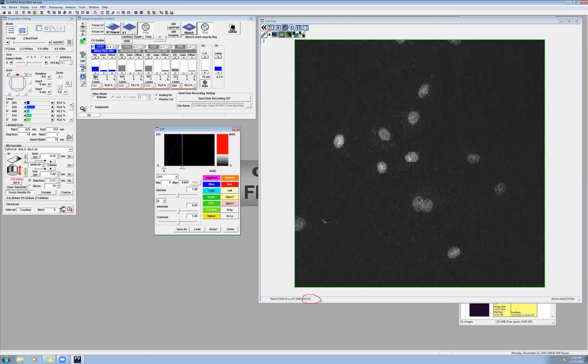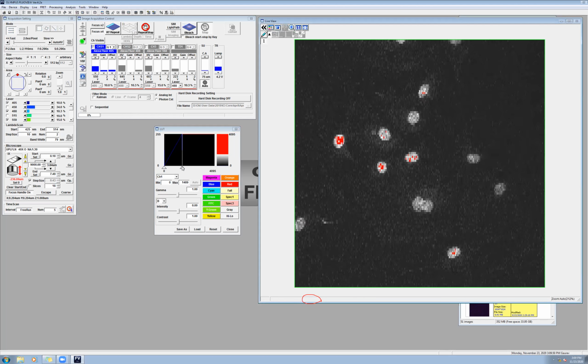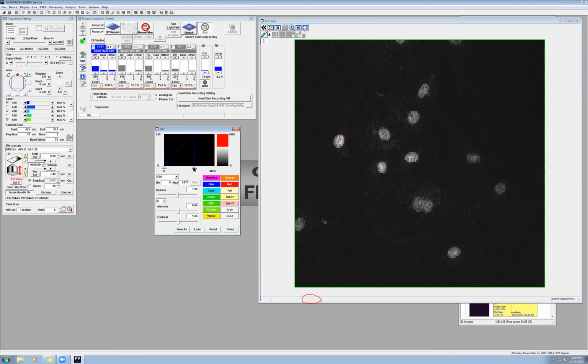Okay. So let's bring this up to about 550 and do a quick scan. Focus times 4. And if I increase my maxima, sorry, my saturation of the pixel is at about 2605, right? So that's totally fine.